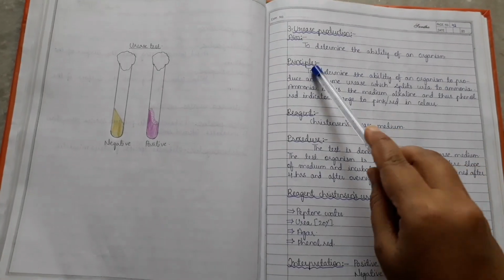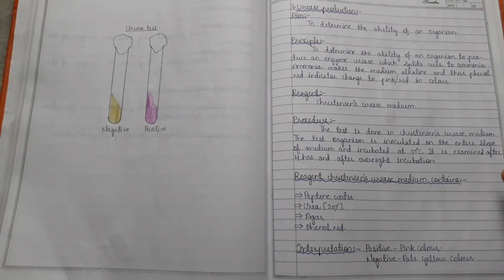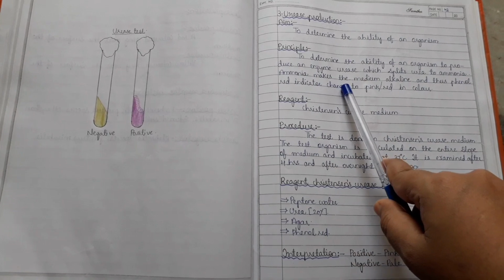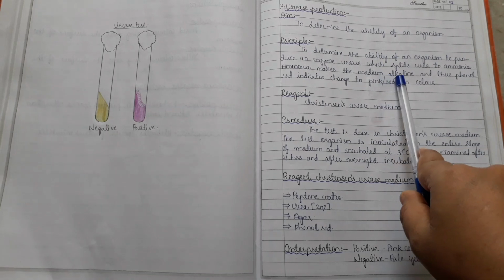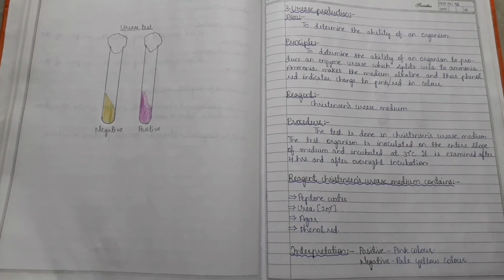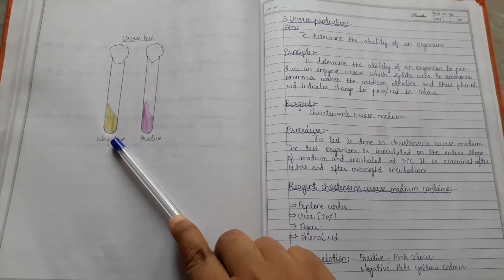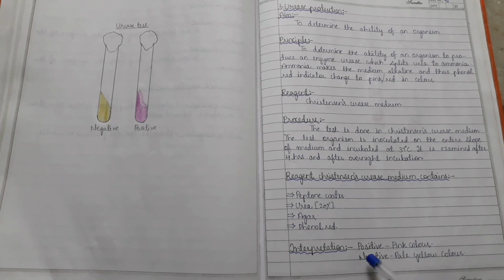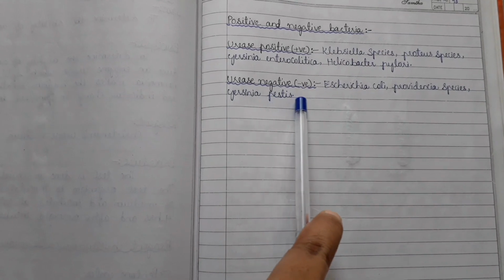So the third one is urease production, to determine the ability of an organism to produce the enzyme urease, which splits urea to ammonia. So ammonia makes the medium alkaline and thus the phenol red indicator changes to pink or red in color. So this is the positive test and this is the negative. So yeah, this is the procedure, reagents and interpretation. So these are the urease positive and these are the urease negative bacteria.